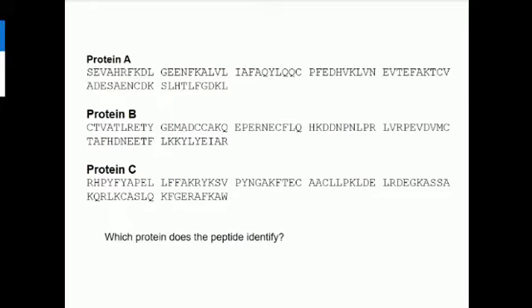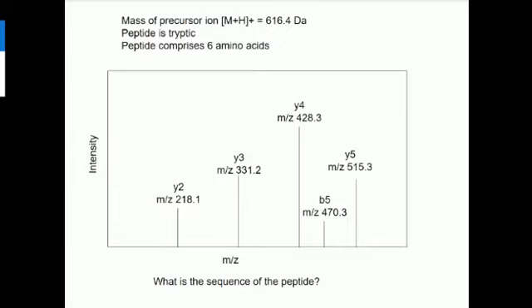That exercise that we've just done is exactly what the protein database does, but it does it for thousands of peptides. It's the same idea. It calculates what the sequence is and then compares the sequence with the protein. Right, so I've got another one, which is a little bit more complicated. I'll give you a few minutes to have a go at that one, and we'll go through it. Can I rub this one out? Has everybody got this?